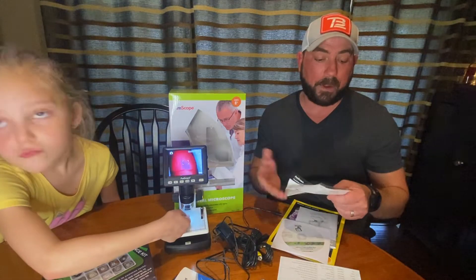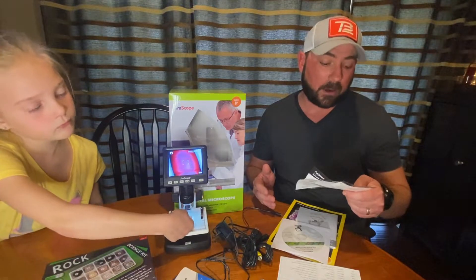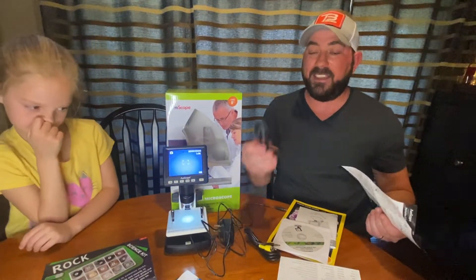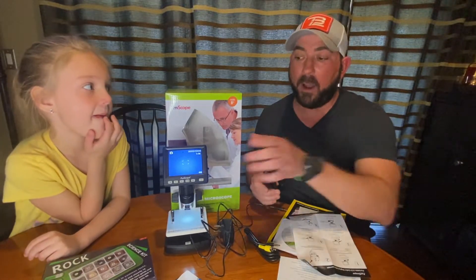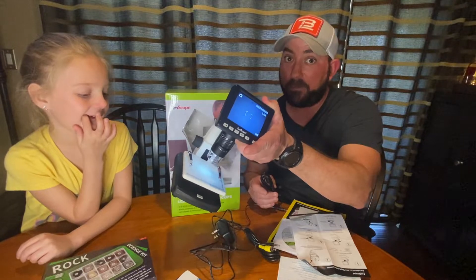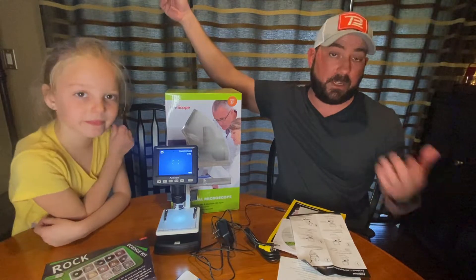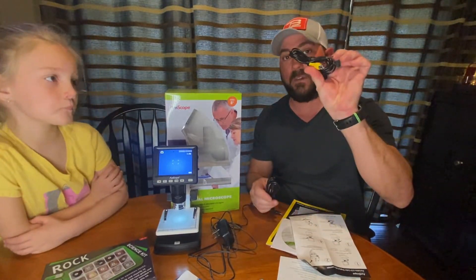Quick note about this: the package includes a lot of neat things like an LCD, battery, and cords to charge it quick. This actually plugs into your TV, so whatever you're seeing on this screen — basically the size of your phone — you can put on a big television if you'd like, or you can hook it up with this cord for the TV.